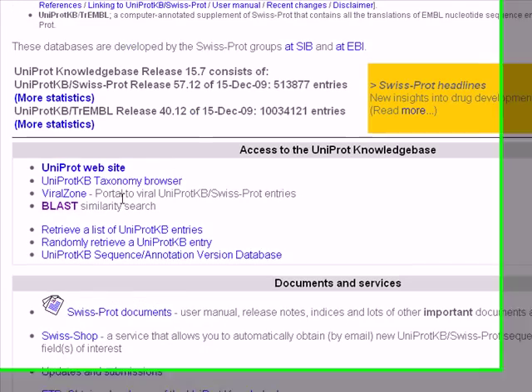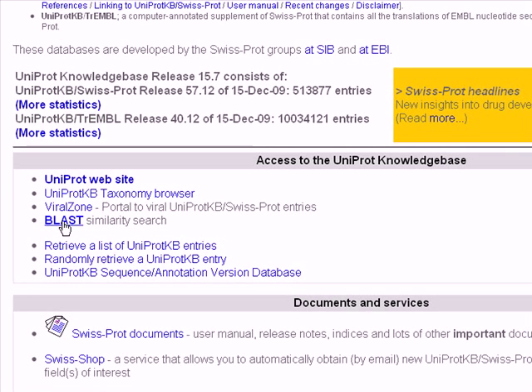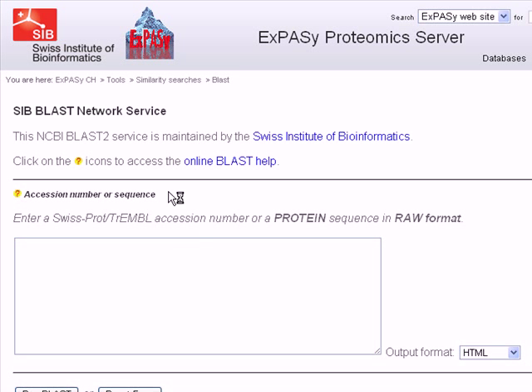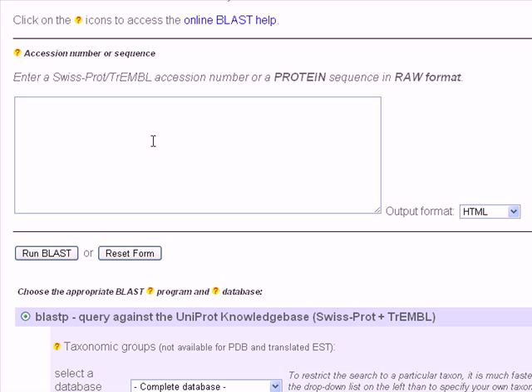We scroll down and we click on BLAST, which is for similarity search. Here it's the main page of the BLAST software.